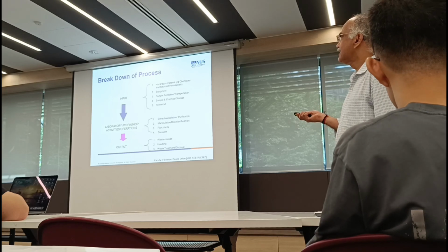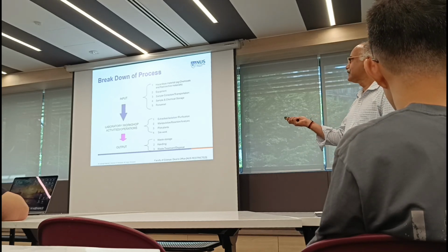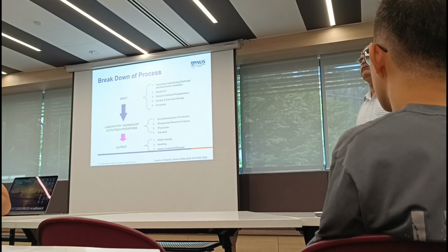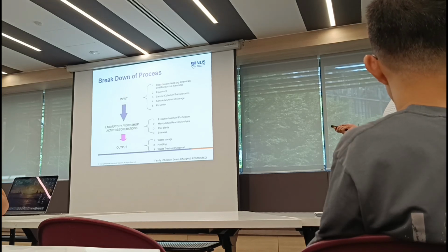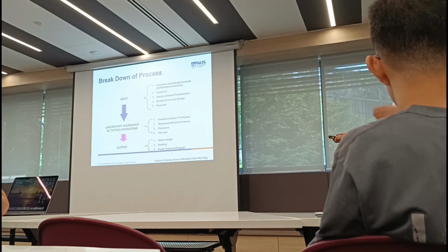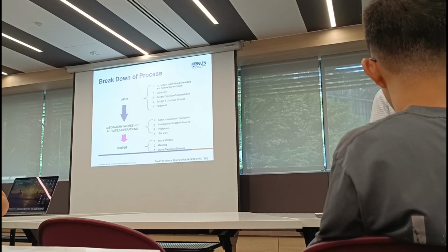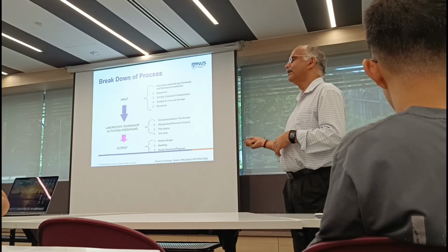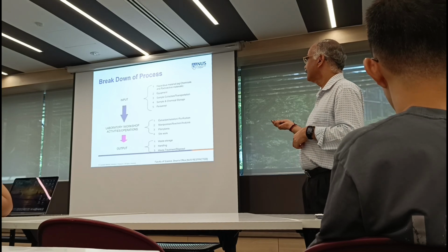Okay, breakdown of process, as I said: input, laboratory workshop, activities, operation, output. So this is any reaction, right? You have some inputs, your starting material, etc. Output is your product, and then procedures, right? Hazardous materials, also when you talk about your starting material, there is a lot of consideration, right? You need to know your chemicals are really okay to handle, what kind of special consideration you need, etc. Am I using radioactive material? Then I need to have those kind of processes.